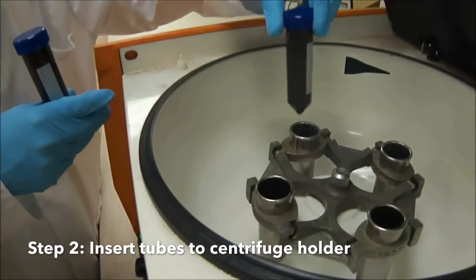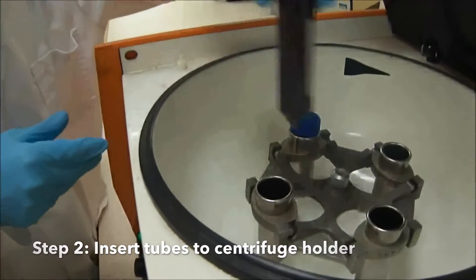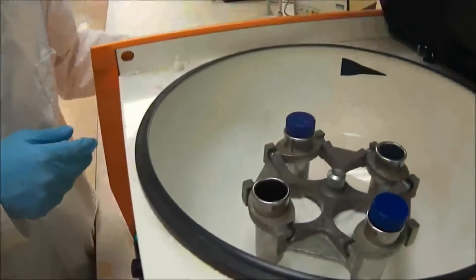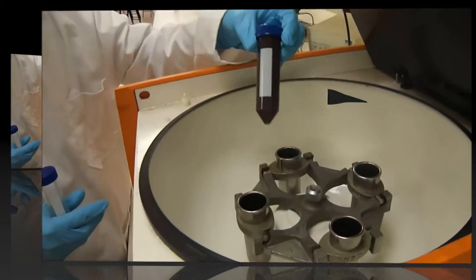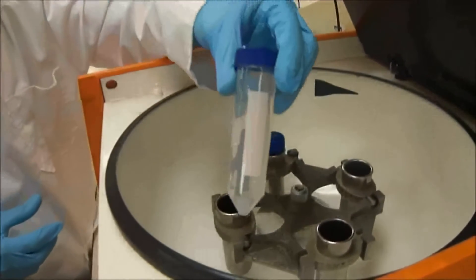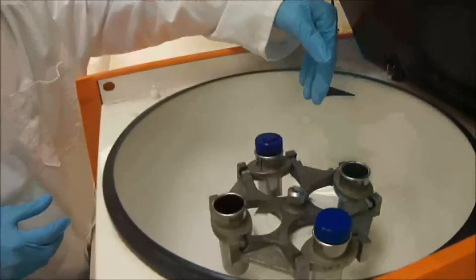Next, place the centrifuge tubes into the centrifuge holder. Ensure that the tubes are placed directly opposite each other. If there are an odd number of samples, compensate by putting another centrifuge tube filled with water on the other side.